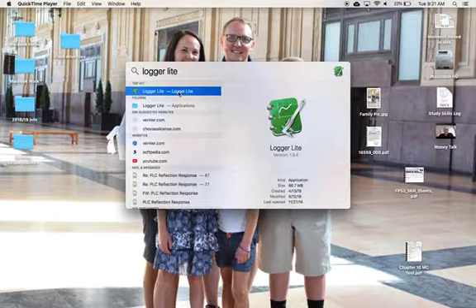Go ahead and use Manager to download it. We might not have time for you to do that for this lab, so you can always pair up with somebody. Just make sure that your computer is set up in the following way.